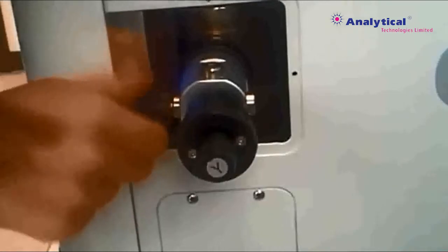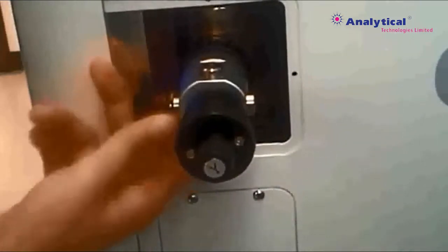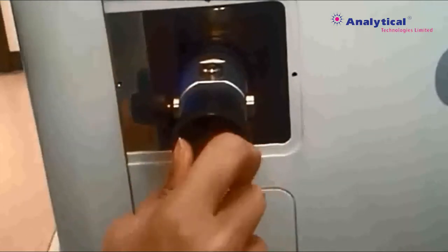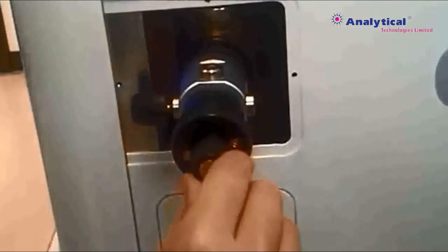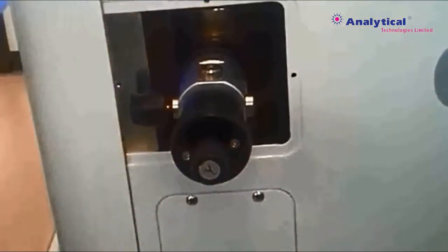If the diaphragm is turned too much, the image will not show. In such cases, move the X knob to center it. Turn the Y knob till the end and unwind it 4 times. After this process, the turned diaphragm will find its rightful place.